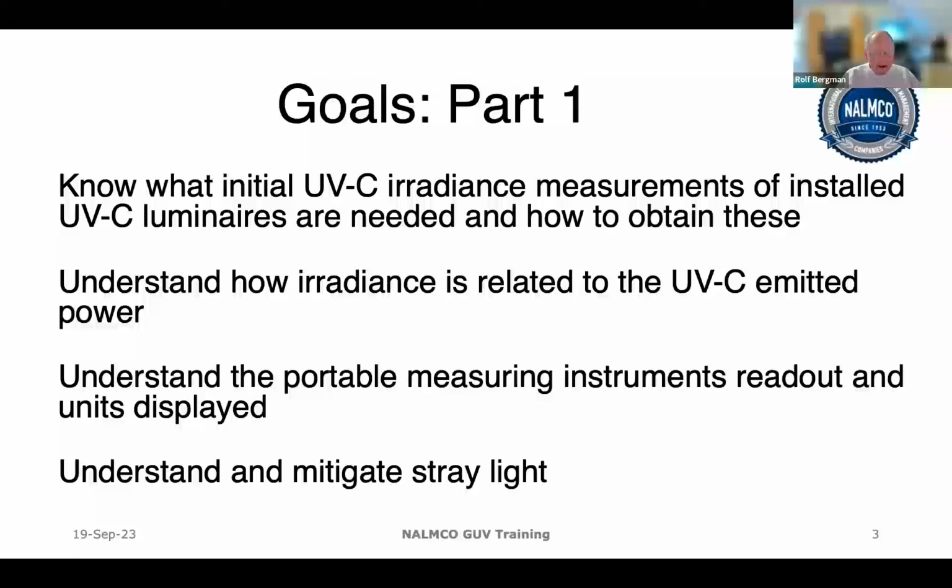And finally, the units tend to be susceptible to stray light from the UVB or UVA, and so these have to be dealt with. We're going to talk about how to remove such stray light, so you will understand the necessity of doing so.